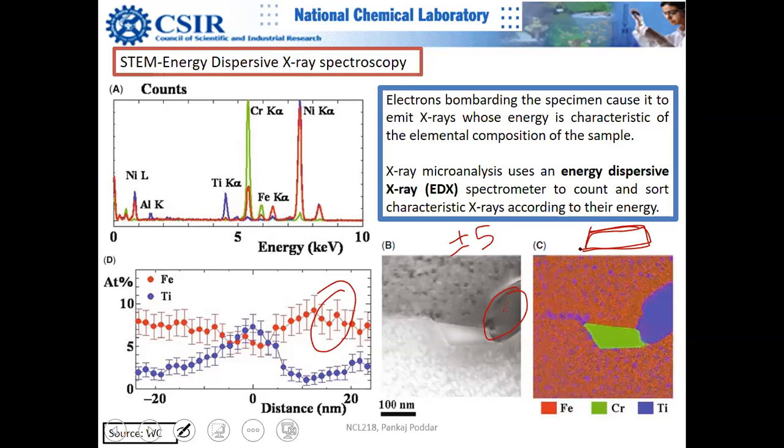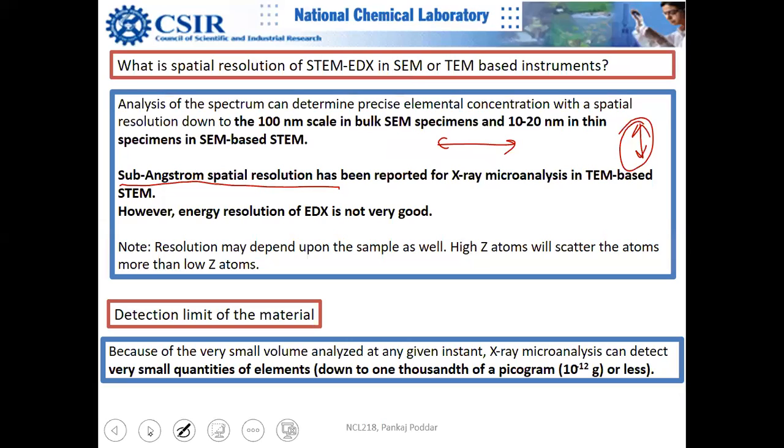And suppose here you have a certain number of... let me do it in a nice way. So this is your particle you have made, and if I draw two lines, suppose the total is 8 nanometer or 6 nanometer, let's say 6 nanometer, and this is 2 nanometer, 2 nanometer, and 2 nanometer.